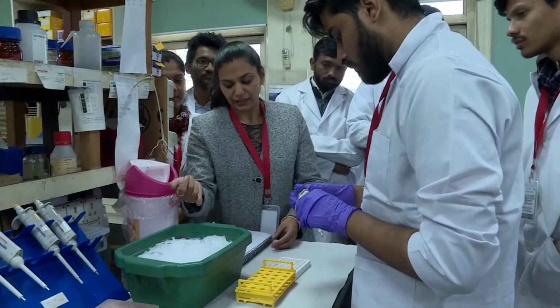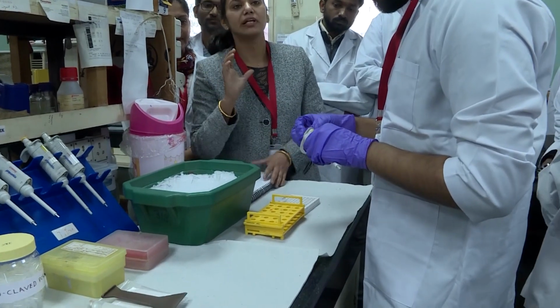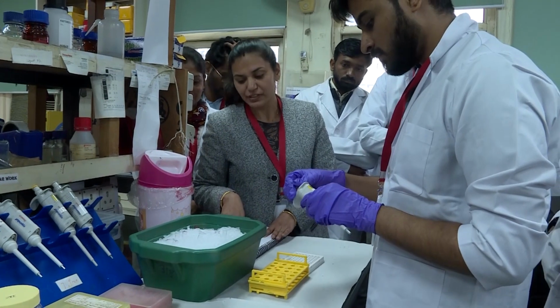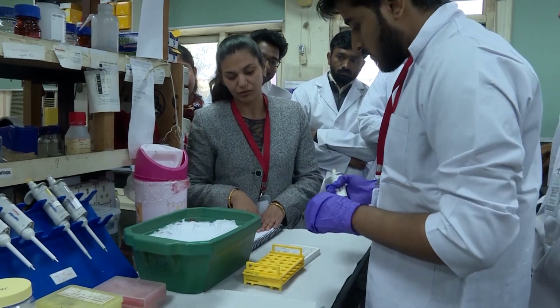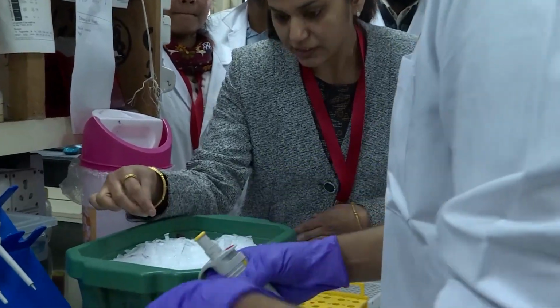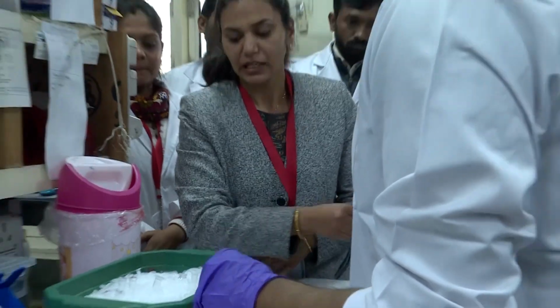We will add 80 microliter of SYBR Green and nuclease free water. Here we are using nuclease free water, 65.6 microliter, which we will add. This is the nuclease free water. First set your pipette. How much is it? 80 of SYBR.